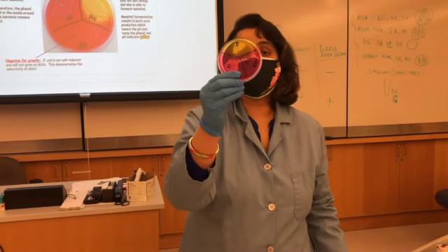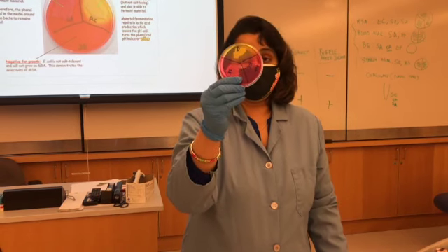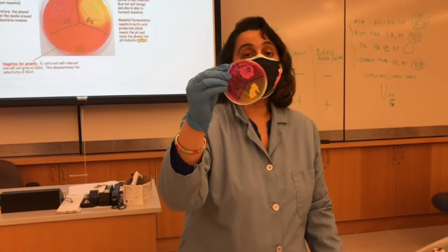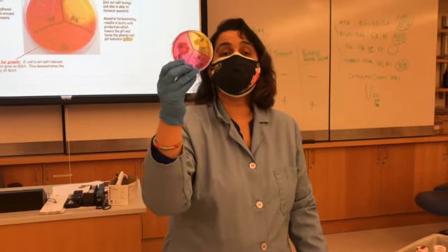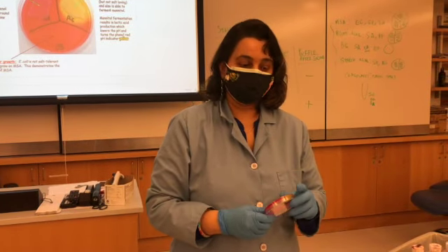Okay, so this is positive for fermentation and also positive for growth, whereas Staph epidermidis is only positive for growth but not positive for fermentation. So this would be your very first indication that the patient might have a Staph aureus infection. But how do you confirm it?